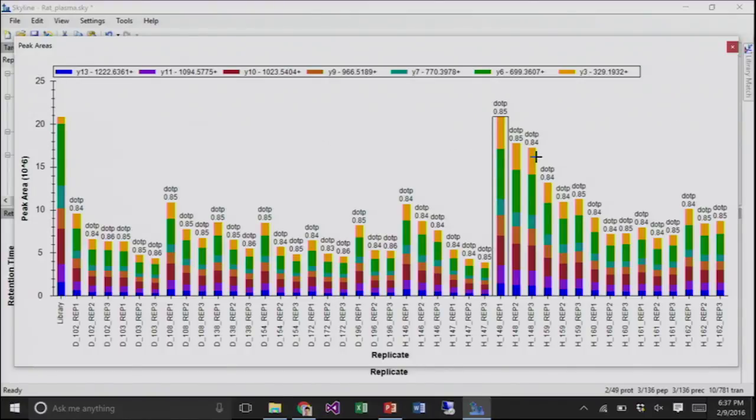And so yeah, if we have technical replicates, we can learn stuff about the system. If these weren't technical replicates, would this mean anything? It wouldn't. If they're all biological subjects, then we cannot say, oh, we expect these ones to be like these ones. And so the fact that we have the technical replicates allows us to say there seems to be a systematic degradation of signal over time of our acquisition. Okay.